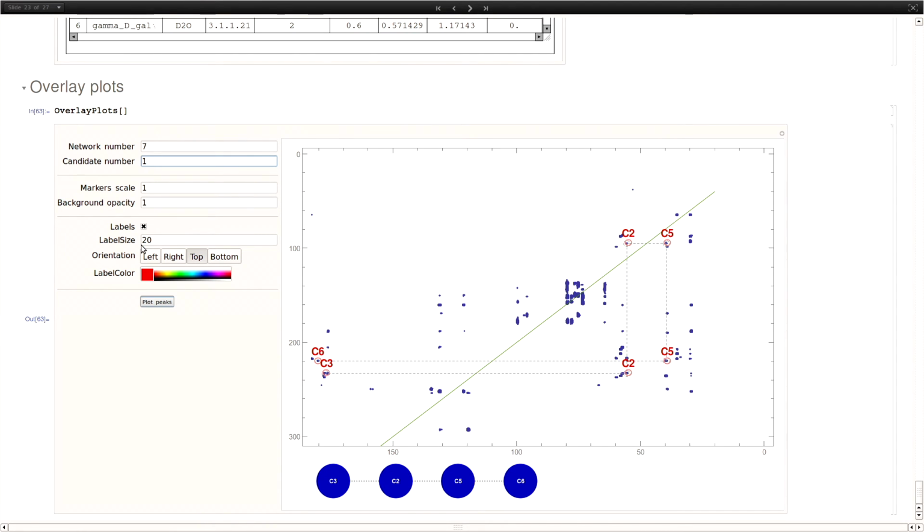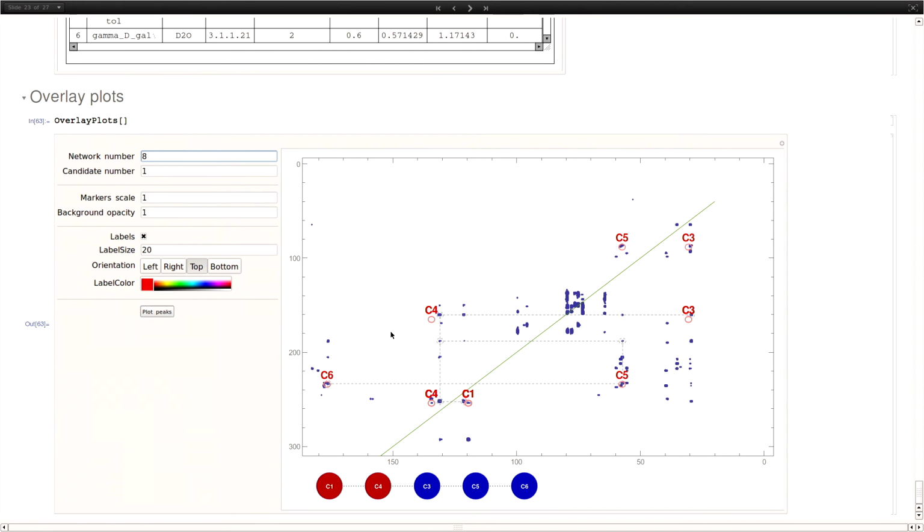On this diagram, you found one network. What about other peaks? Are those other molecules? You mean the other networks? You identified several peaks that form the molecule. What about the other peaks? Do they correspond to others? Yeah, but they are not part of that network. Let's try this one here. This is another network with other peaks, and I don't know if this did a good job, probably.